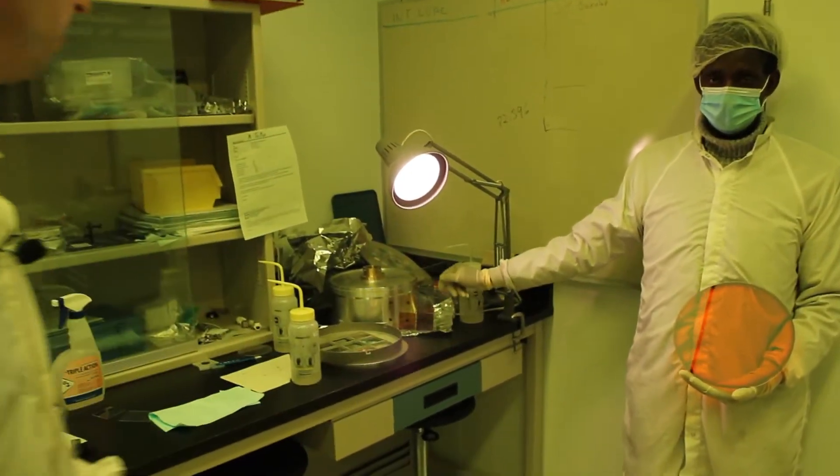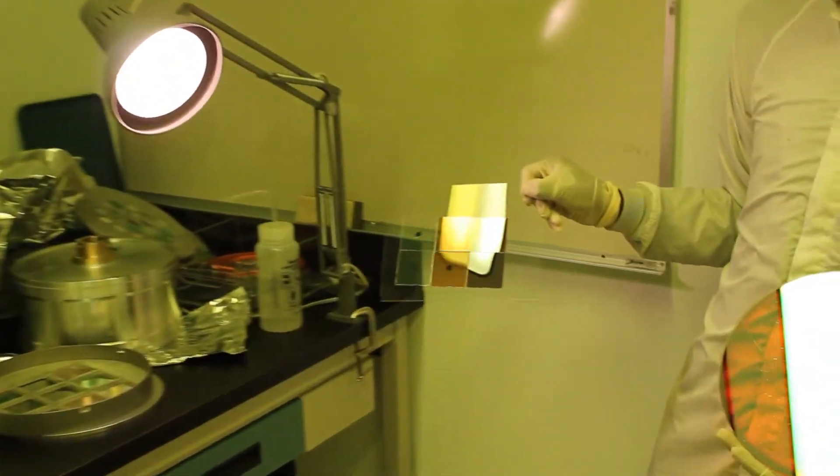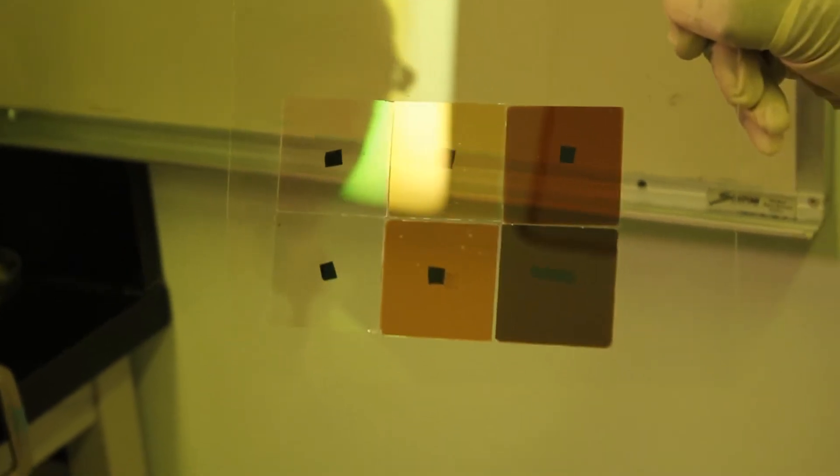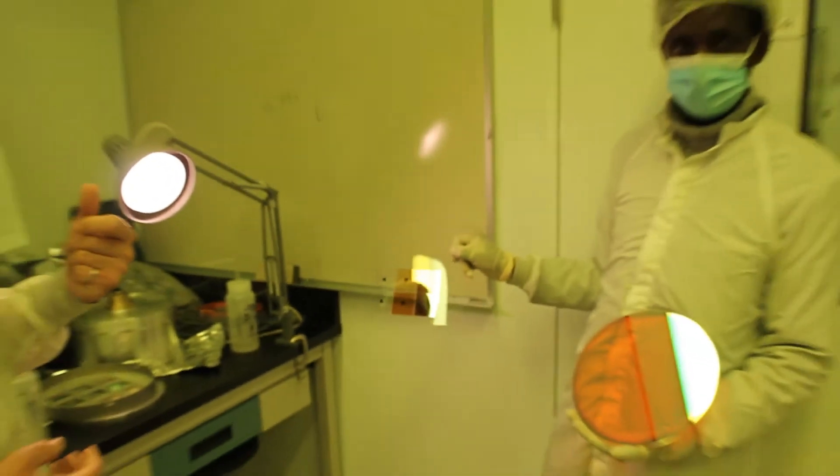Another example of what he can produce. In this test right here, he was varying the oxygen to nitrogen input in the Intelvac chamber. And what we can see here is a slight difference in the refractive index, the effective refractive index of the final coating.